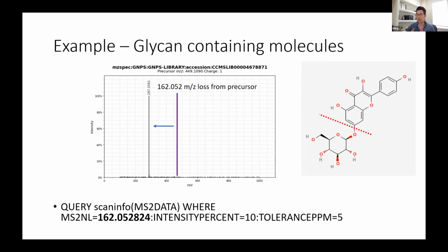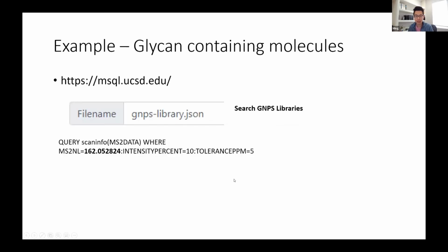And so if you try to play around with a particular query, you can see whether it manifests the kinds of molecules that you're expecting, or whether you need to be a little bit more specific about it. And so what we'll do, let me put it in the chat here.